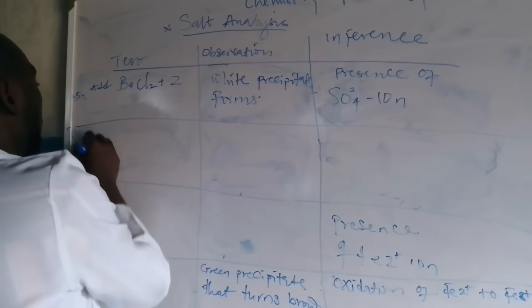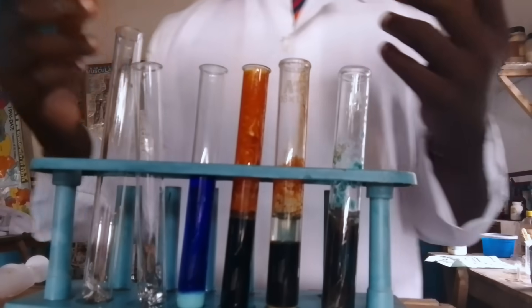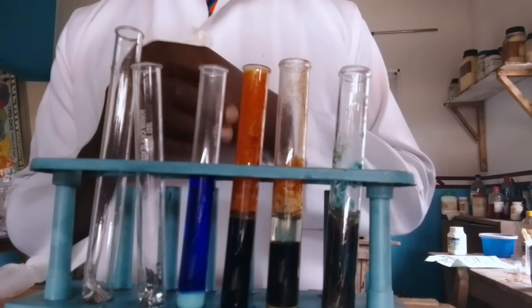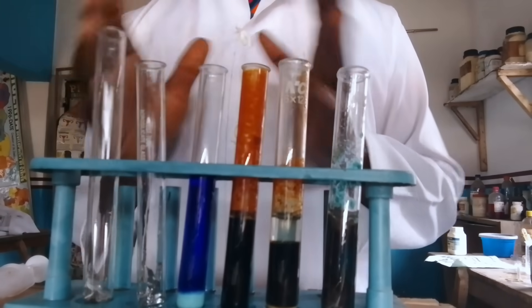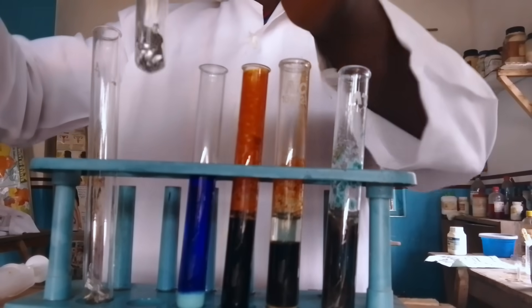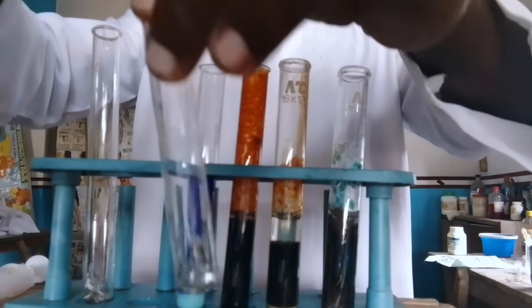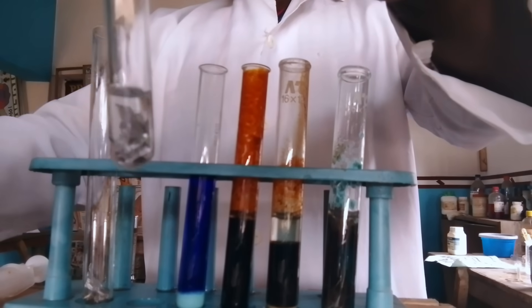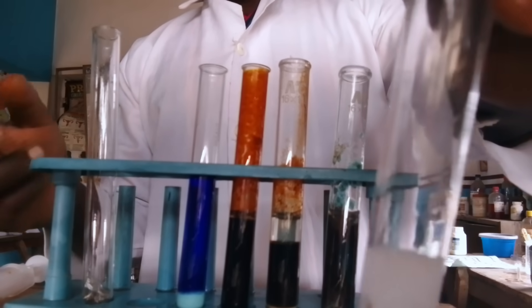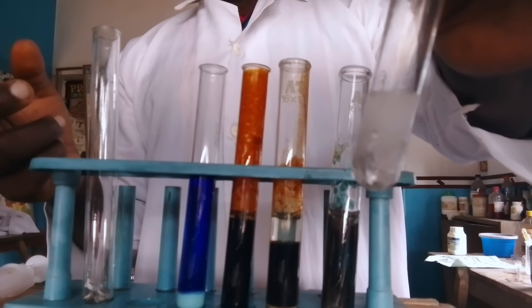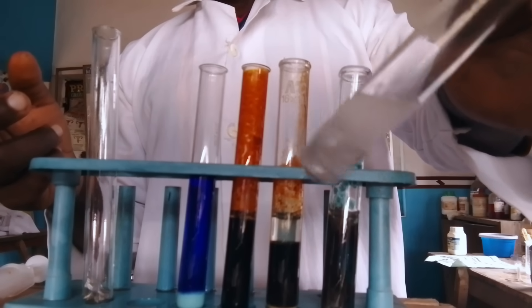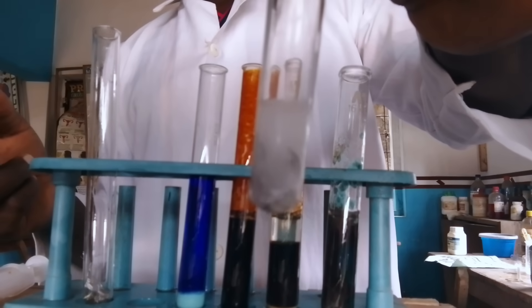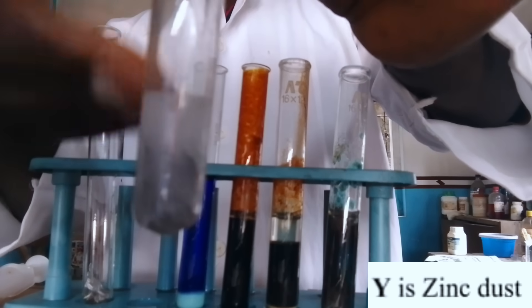This is our zinc powder. We are going to be adding dilute hydrochloric acid to our zinc powder. Now you can see it is producing something like smoke and it is boiling — effervescence is observed, with smoke going up.